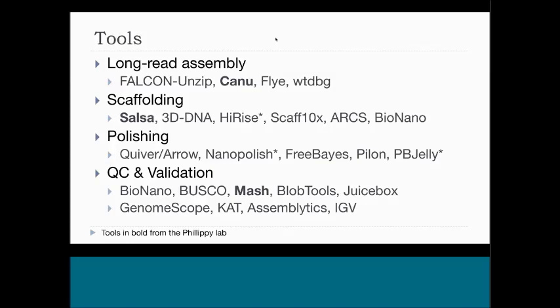Okay. But definitely, my recommendation is to do long reads, assemble it with one of these assemblers, and then use the Illumina data either for validation or polishing at the end.